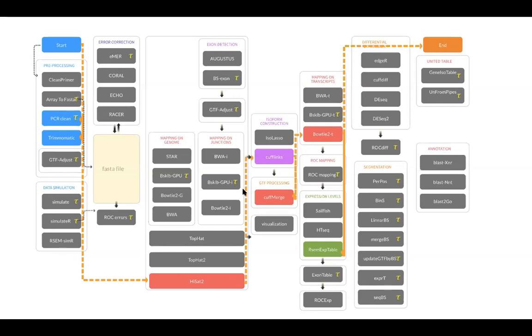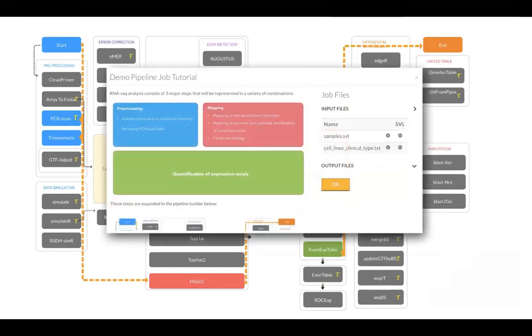However, knowing what the meaning of those novel transcripts might be will require some additional interpretation. So the basic steps, as we reviewed last time, are pre-processing, which is working with the individual reads before we know where they align, making sure that the reads are cleaned from any additional sequences, and reads that are unexpectedly abundant are typically eliminated or moved down to the level of transcription that is expected from the overall file.